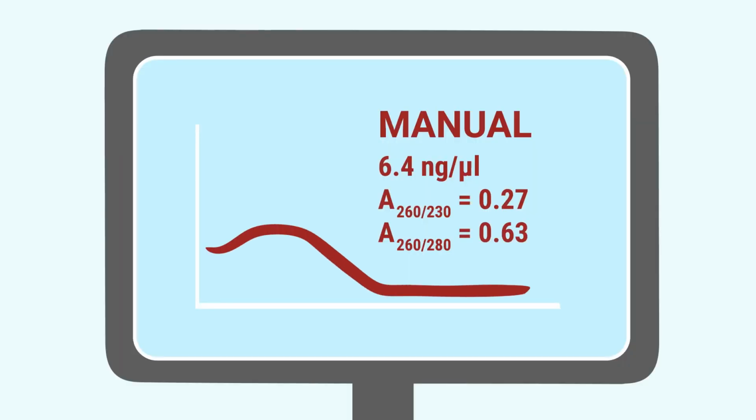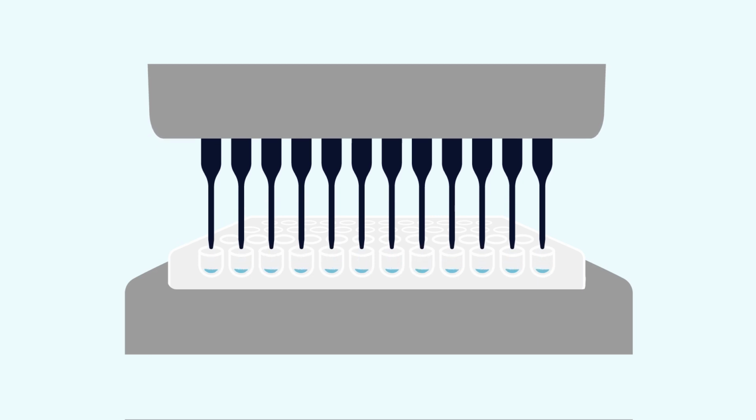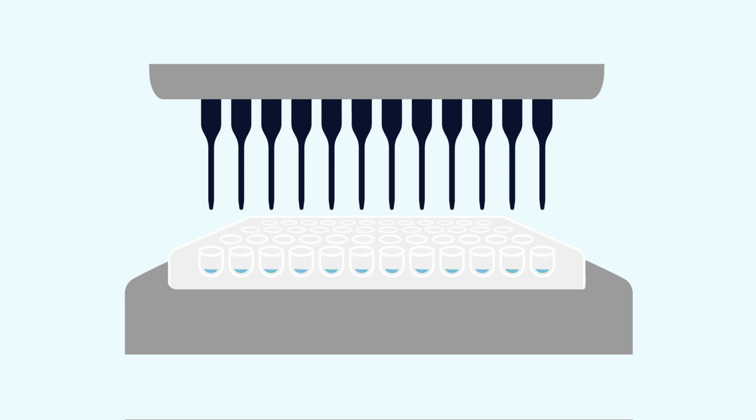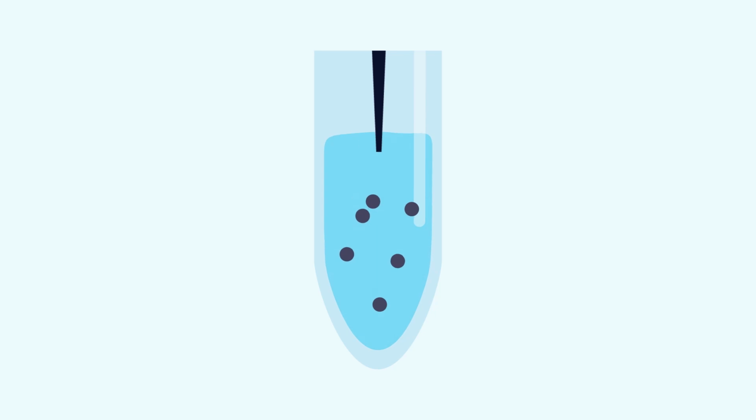If the beads are fully suspended during the wash step and you still see low purity, there might be a problem with liquid handling on the robot. If the robot does not fully take up supernatant during the wash steps, impurities can persist. You can adjust liquid transfer volumes. You can also add another wash to dilute the lingering contaminants. Use a polar, non-viscous solution like 80 to 95% ethanol or the solution used for the recommended final wash.